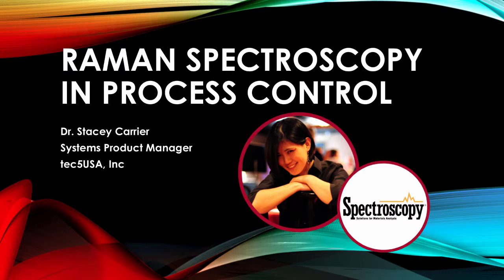Now, for the vibrational spectroscopies, Raman is most analogous, most complementary to mid-IR spectroscopy. Except Raman is actually easier to use and process for some reasons. First of all, with mid-IR, a lot of times the instrumentation has moving parts in order to get the resolution and wavelength range necessary. It has moving parts, which is something people in process control want to avoid, simply because a moving part means that someday it will break.